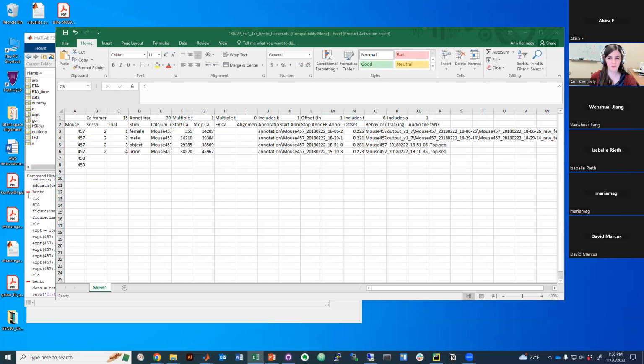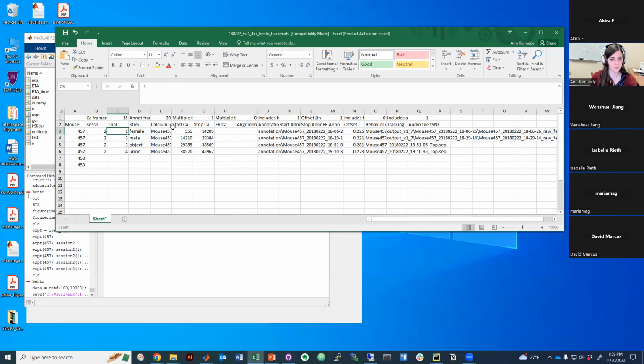Multiple channels as separate files for the same experiment. If it's neural data, that's not currently supported, you would need to be able to concatenate those channels into a single file. We support multiple behavior videos by appending them into the experimental loader. We also support multiple annotation files, concatenating them in. And we haven't had this case of multiple files containing neural data, what you'd load in as calcium imaging traces here. So it's not currently supported, but it's something that we could add if there's enough interest.